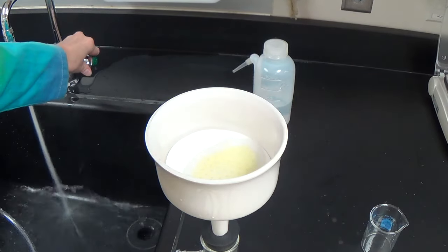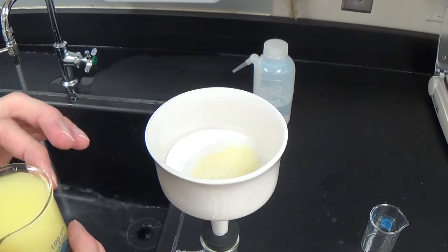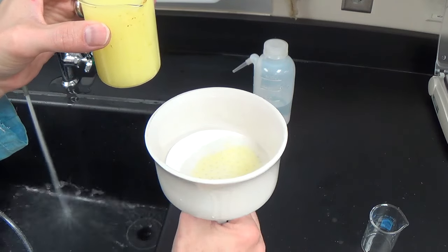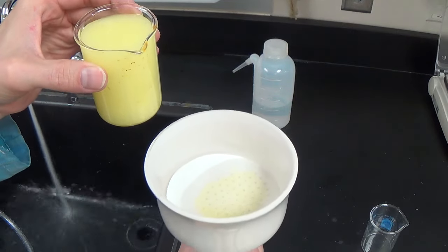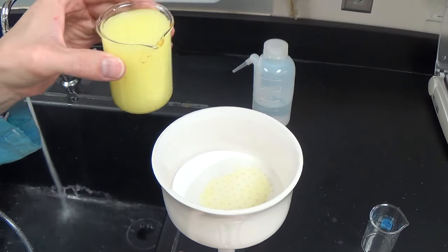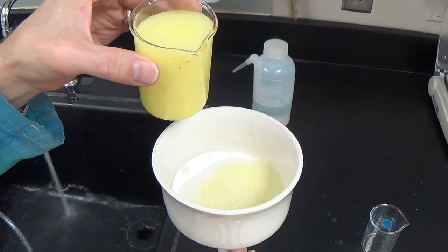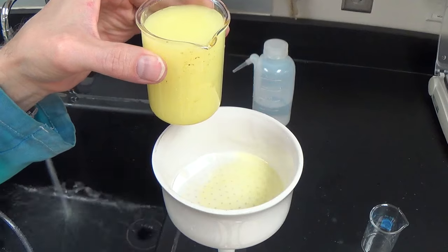So you can see, as my filter paper wets, it's also going to be pulling the liquid through those holes into the flask. Okay? And I'm going to slowly and carefully pour into the center and get it to filter. All right, so you would pour through all of this.